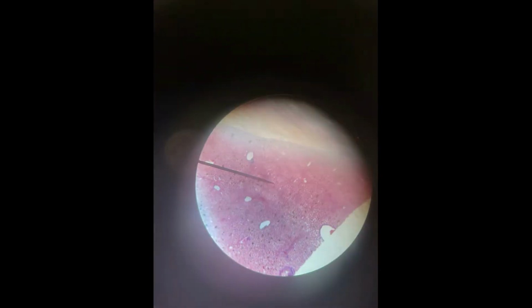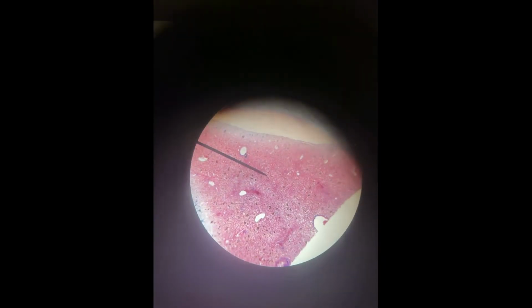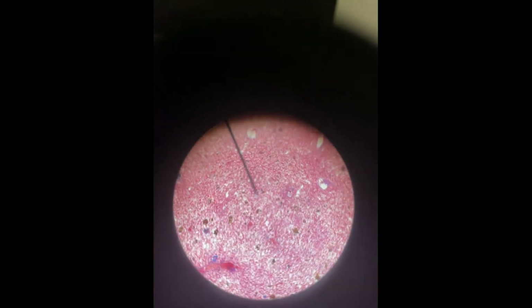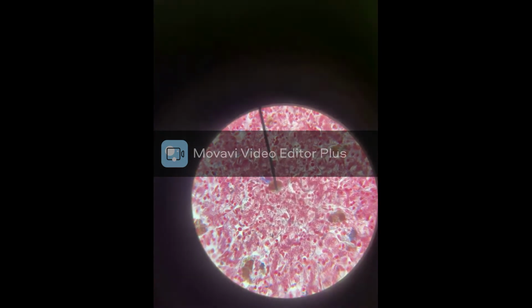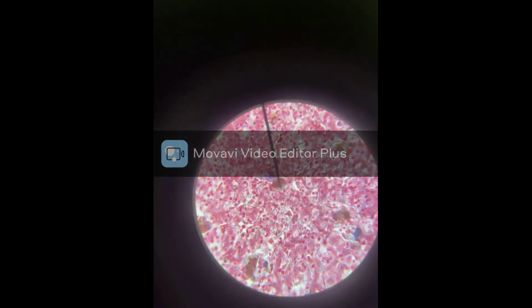Now take a look at some animal cells, some salamander liver cells. And so again, zoomed out, medium zoom, and all the way in. And we can start to really see some things when we're all the way zoomed in there.